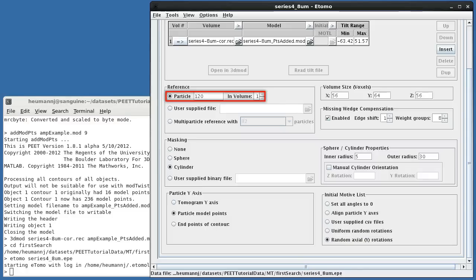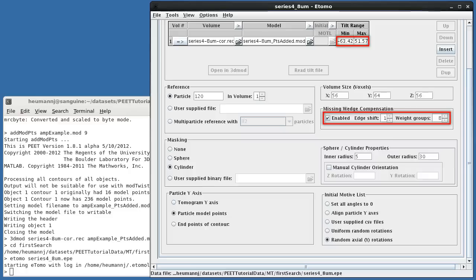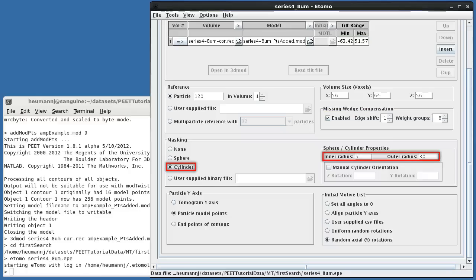I've picked a reference particle near the center of the microtubule, enabled missing wedge compensation and specified the tilt range, and have requested a cylindrical mask. We'll verify the mask dimensions and orientation shortly.